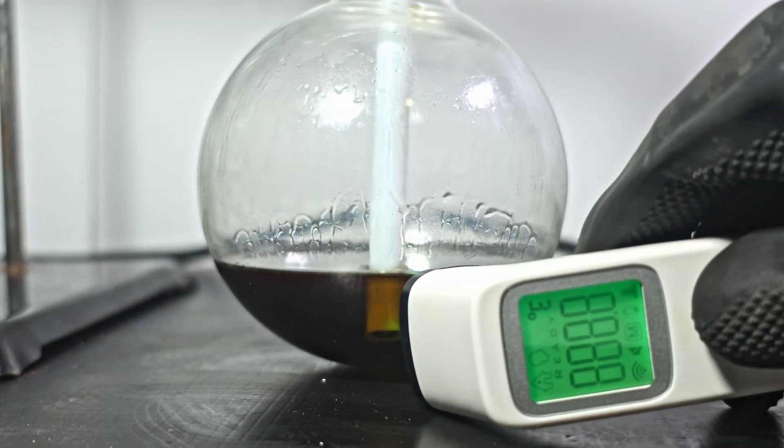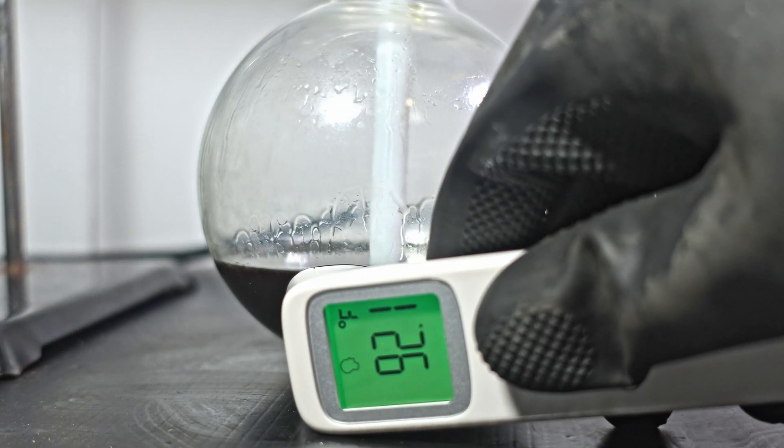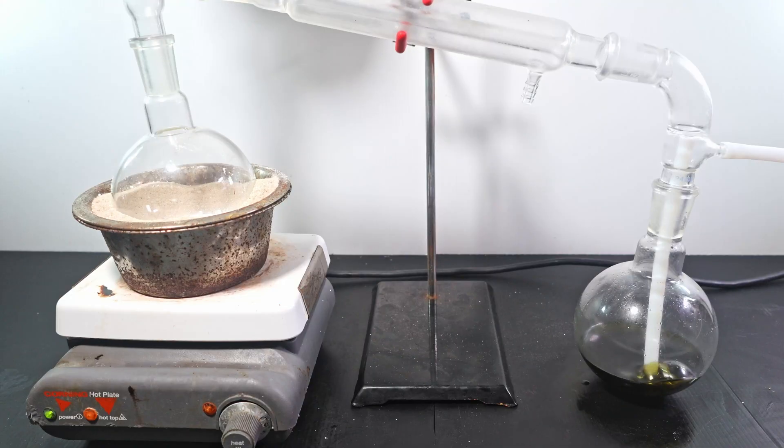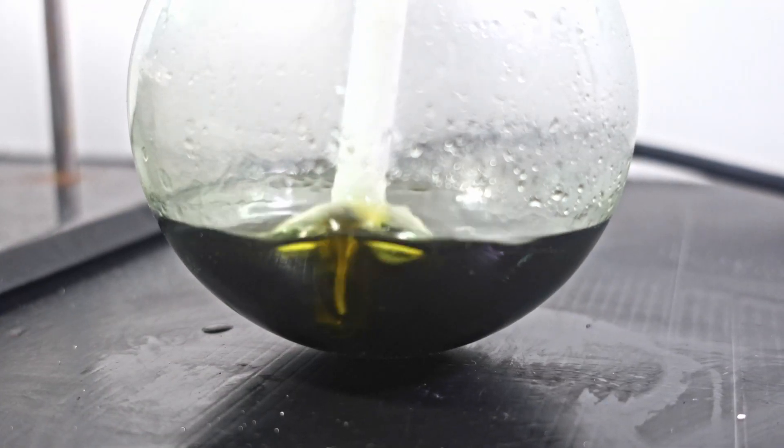Before I perform the chlorination, I take the temperature of my hemp oil. This gives us a baseline for what comes next. After, I perform the same process but without water. Air is quickly evacuated as chlorine evolves. The reaction proceeds almost too fast.